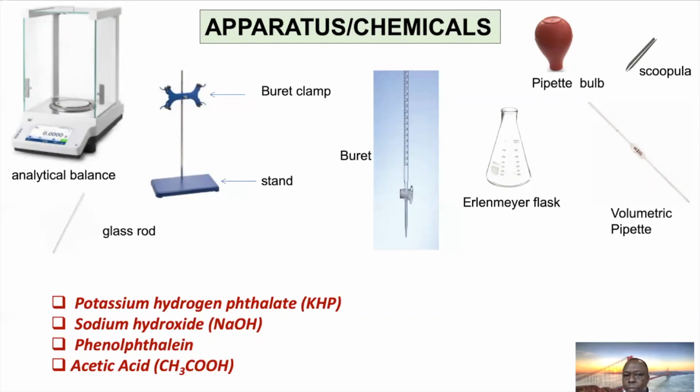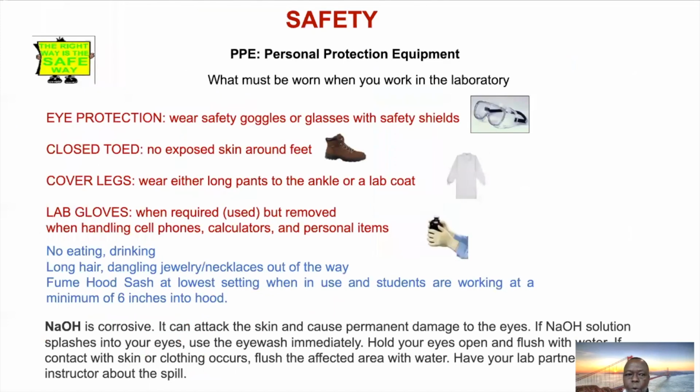In the data sheet, there's a place which will call for balancing the equation. We'll come back to that. This is just a safety precaution. If we were to come in the lab, we always pay attention to safety.